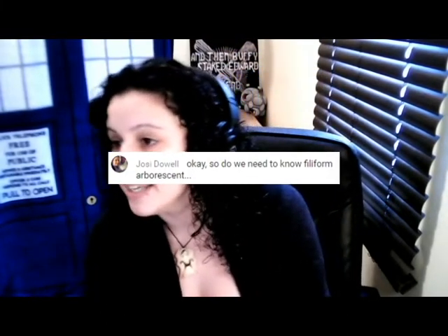Josie, as to your question, you should know that the filiform is the straight form and the arborescent looks just like the filiform, except there are branches coming out of it, so it looks more like a tree. So yes, if she puts the diagrams on the exam, they will be very clear.